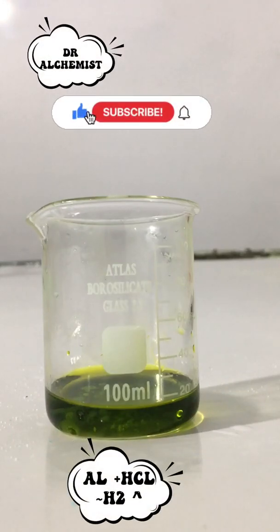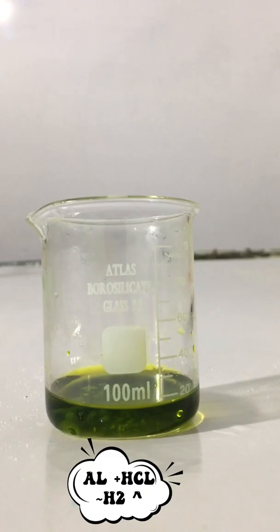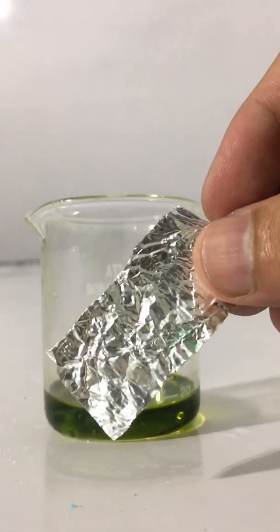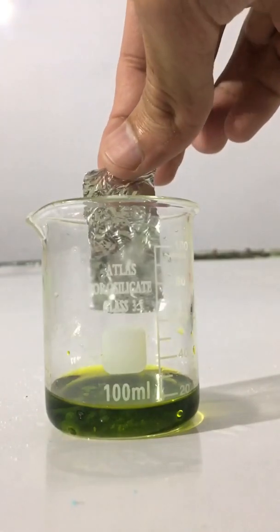Hi everyone, today we will perform a short experiment between acid and metal. How acid reacts with metal and we will notice the release of hydrogen gas by introducing flame. This is an aluminum foil and you have to introduce it in acid containing copper sulfate.